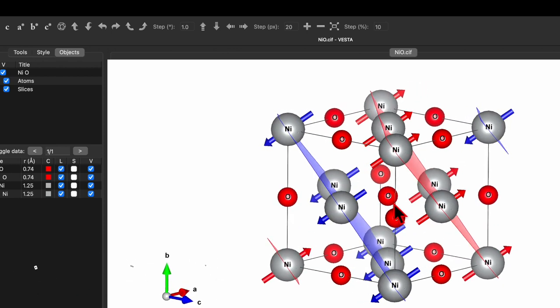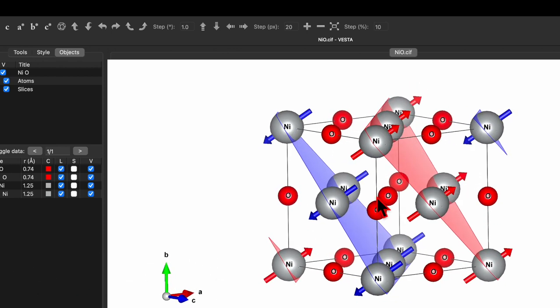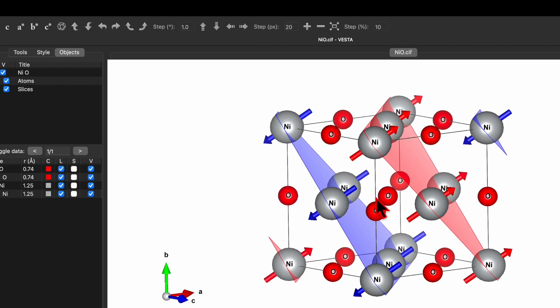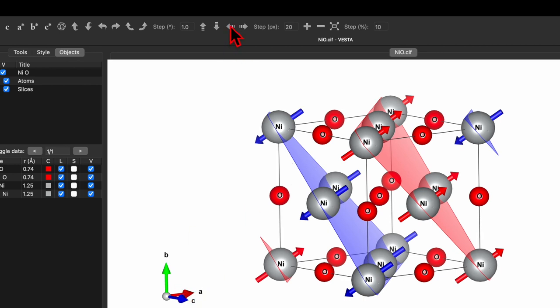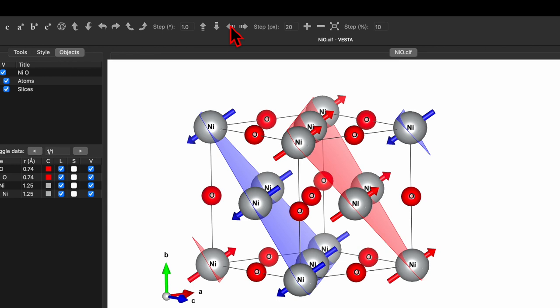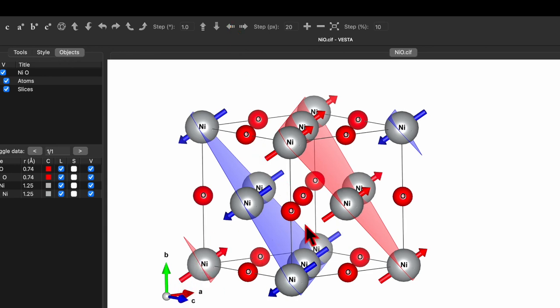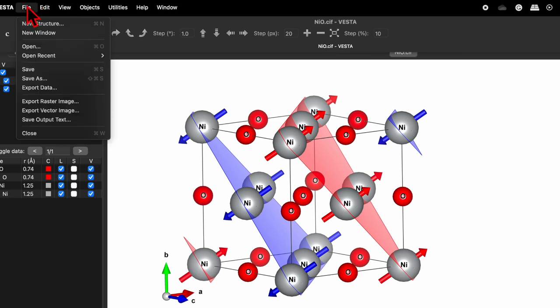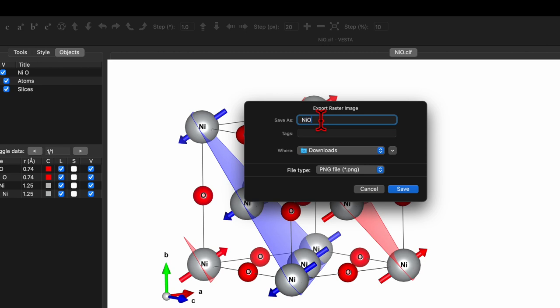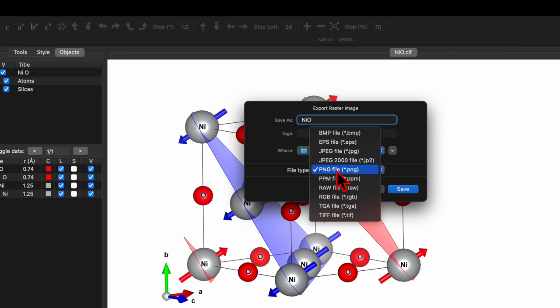It looks beautiful. You can set the position as desired. If you want to include the axes, use the arrow pointing left to add a compass and also the unit cell. Then go to File and click on Export Raster Image.